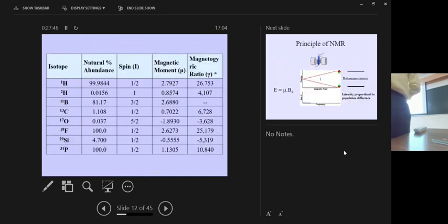These are some of the data for the different nuclei which are of common interest in biology. You have the proton here, the deuterium here, which is spin of 1. Of course, this is so much in material science. Carbon 13 is spin of half. We don't do so much in chemistry or biology with these. This one we use, half, half, half. So by and large, mostly we deal with spin half systems. If you're working with biology, you work with either proton, carbon 13, nitrogen 15, fluorine 19, P31. All of these are spin half systems. Mostly we will be concentrating on those.